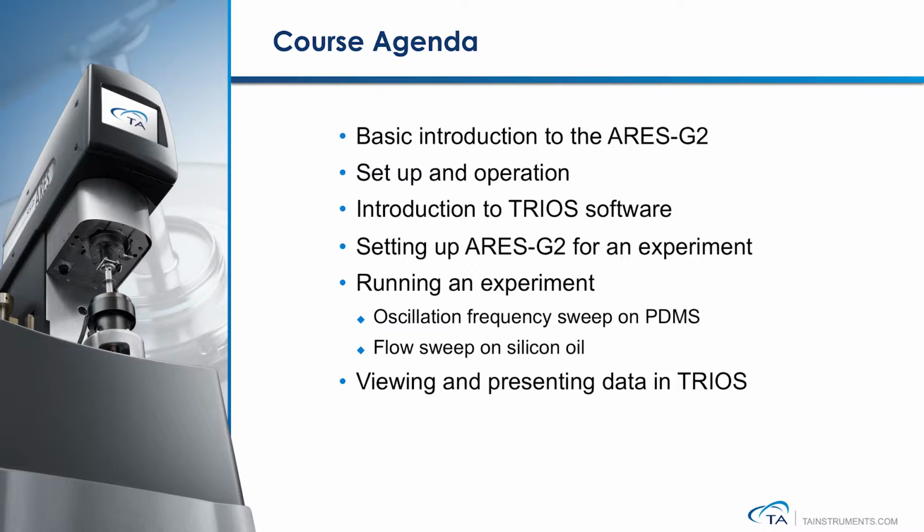The first will be an oscillation frequency sweep measuring the viscoelastic properties of polydimethylsiloxane, and the other will be a flow sweep test measuring the viscosity of a silicone oil standard. We will conclude by pointing out some common features used to view and present data within TRIOS.